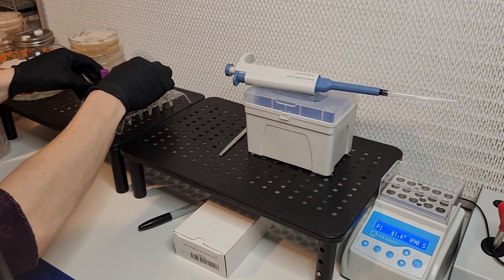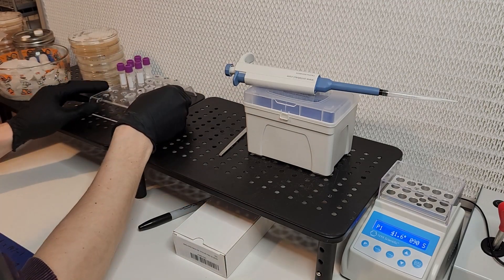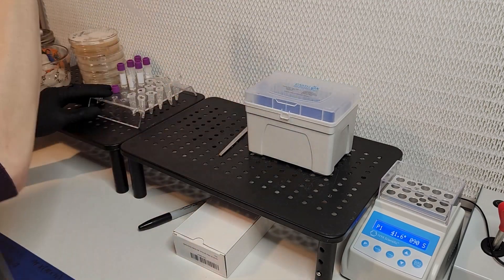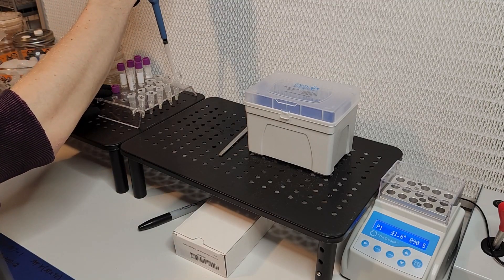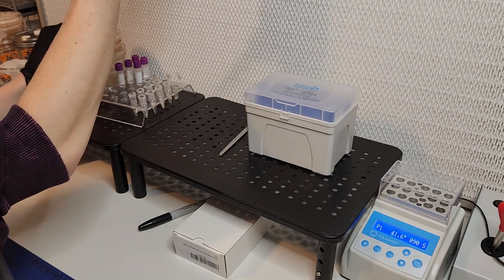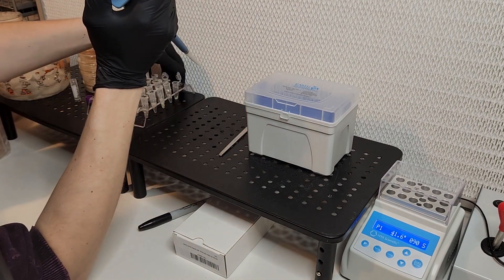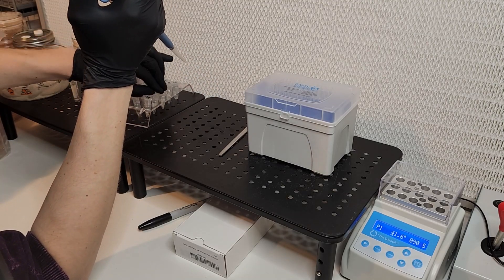Whereas plate mycelium is much more solid of a single unit. Even though it has just as many hyphal tips, you are going to need to mash them together in order to get all of those hyphae to touch.